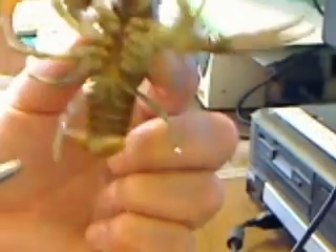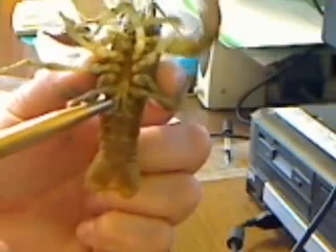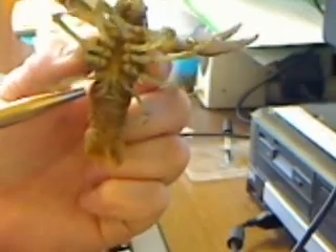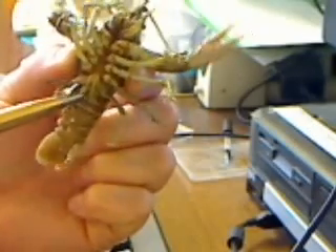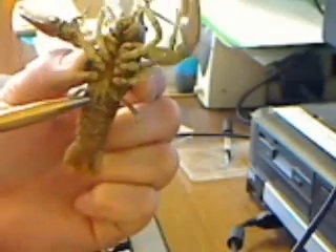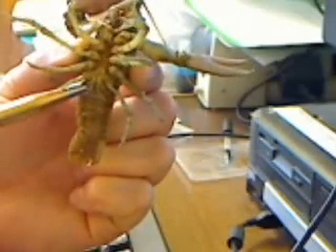If you notice on a male crayfish, if you look right up in this area, there are some large swimmerettes that almost look like legs. This is a male crayfish. They are large and pronounced and you can actually see them.